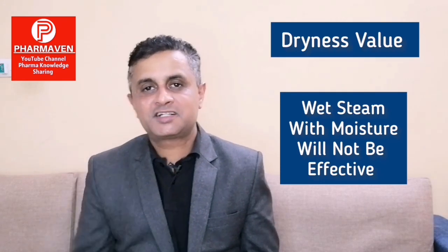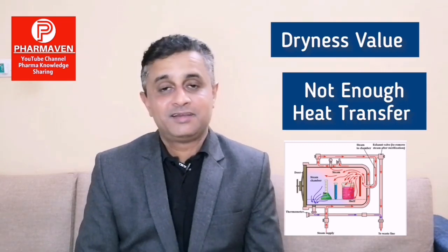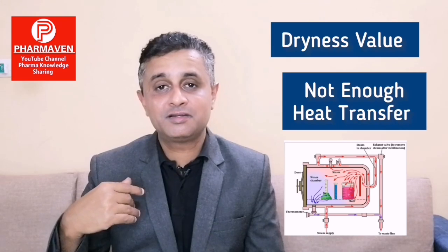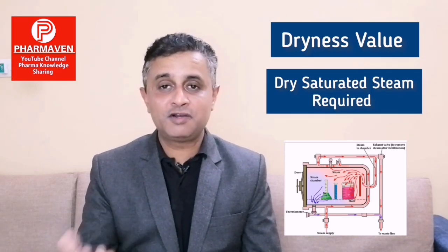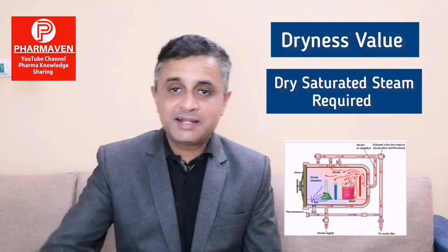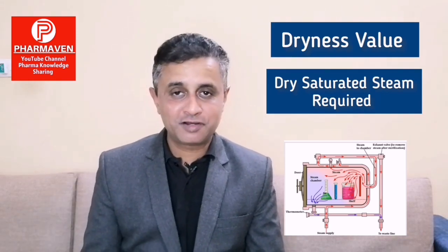There will be a lot of water droplets inside. So what will happen? When the steam gets condensed, there is a lot of water. Water contains less heat energy than steam. So when the steam condenses and it contains a lot of water, it will generate a lot of condensate, but there will not be enough heat transfer to the load. And we know we need heat transfer from steam to load to achieve effective sterilization. So if steam contains a lot of water droplets, then it is wet steam, it is not saturated steam, so it will not achieve effective sterilization. For that we need dry steam with enough moisture so that it will travel, it will condense and it will transfer the latent heat of vaporization to the load.